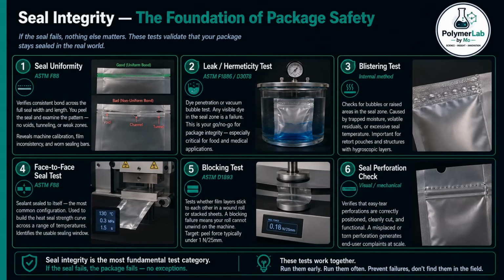Seal integrity. Seal integrity is the most fundamental category of tests in flexible packaging. If the seal fails, everything else is irrelevant. The best barrier film in the world is worthless if the package leaks.